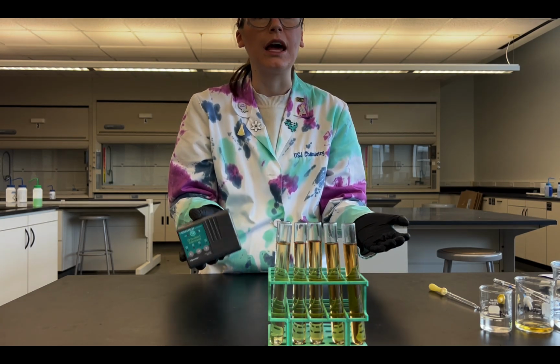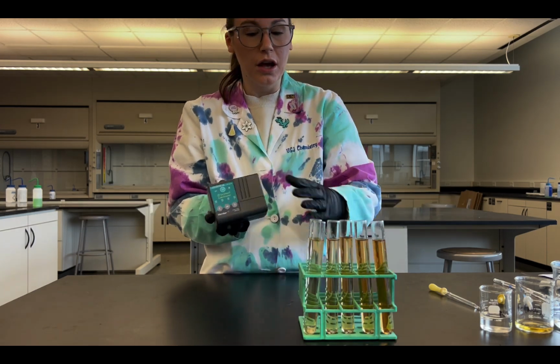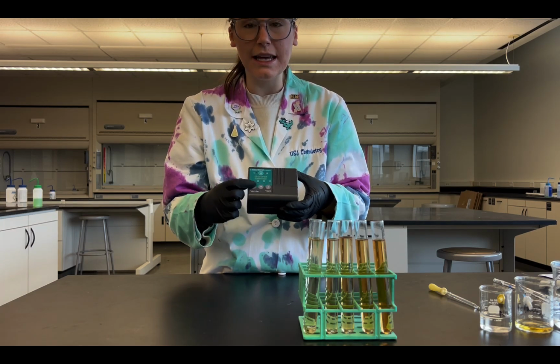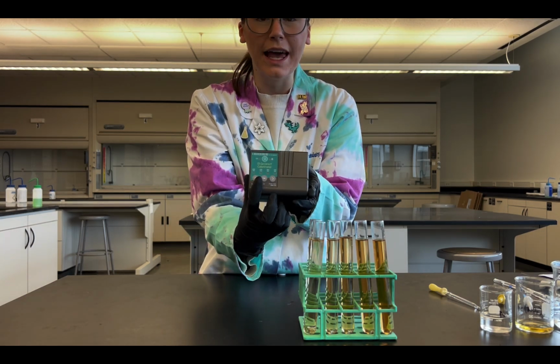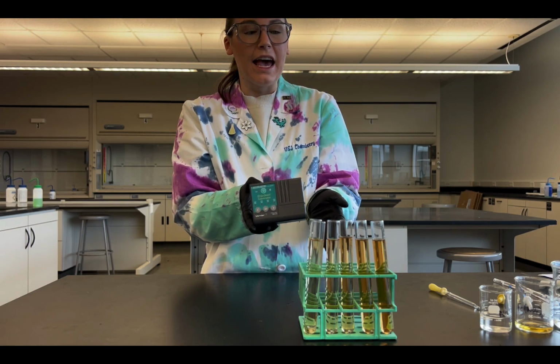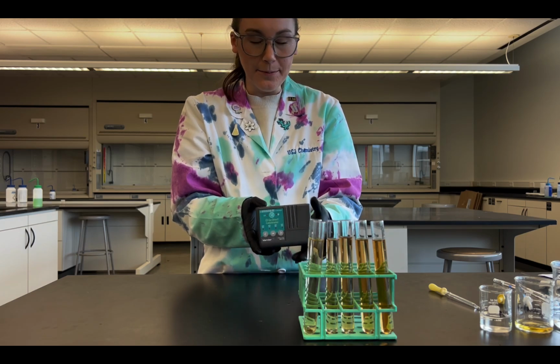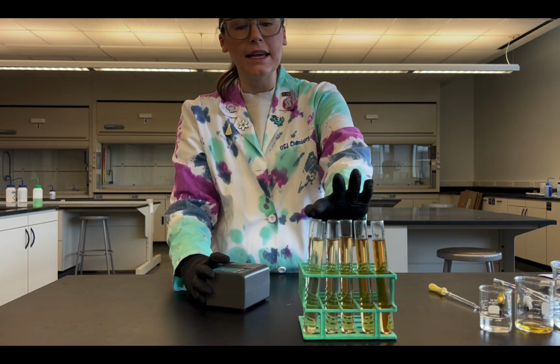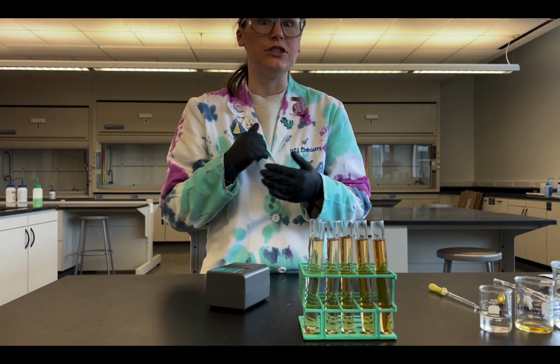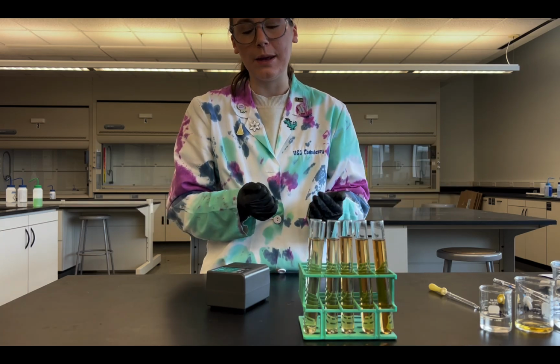Colorimeter meaning a meter that can count colors, figure out colors, track colors. It's literally a color meter. And what I can do is set this to a bunch of different wavelengths that different solutions will absorb, and I can measure how much that solution absorbs of that specific light. As we said before, as I increase my concentration, it's going to absorb more and more light, because the darker the solution gets, the more light it's going to absorb or not let pass through it.